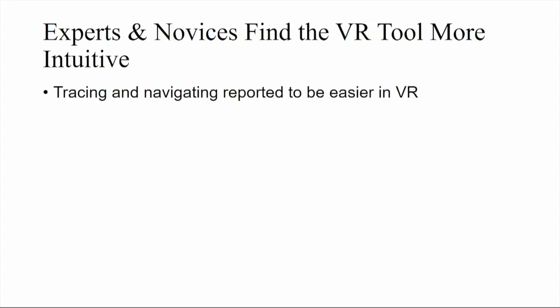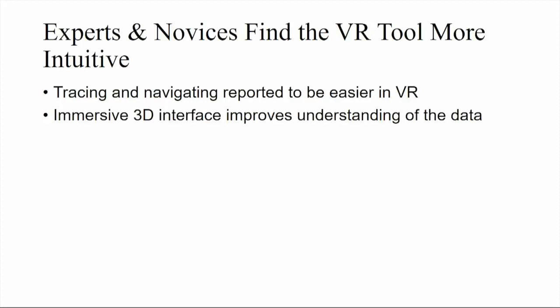They commented that the flexible 3D painting system allowed them to better focus on the data and understanding the tasks they're doing, and seeing how the neuron structures are structured in the brain. They also noted that the immersive 3D interface improved their understanding of the data. Especially one of the novices commented that after working in the VR tool and returning to do some of her sessions in Neurolucida, she was better able to understand the 3D structure of the neurons that she was actually tracing through the image slices.